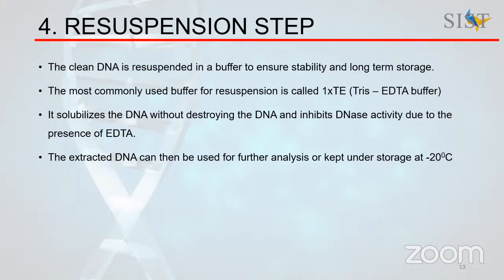So after we get the pure form of DNA, we will resuspend it in a buffer so that it is dissolved in the buffer. Normally we use TE buffer, which is a Tris-EDTA buffer. The reason we add TE is because the DNA can dissolve in the TE buffer, and the EDTA present in this buffer will inhibit the DNA's degrading activity, as I have told you before. Therefore, the DNA is secured and safe in the solution. After that, the resuspended DNA will be stored at minus 20 degrees Celsius for further analysis. All right.